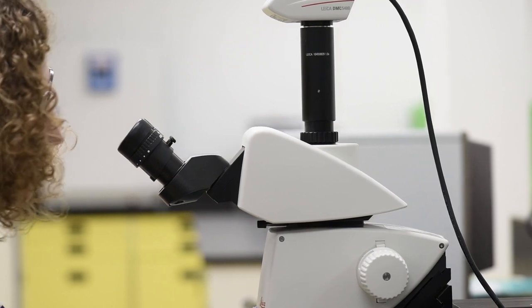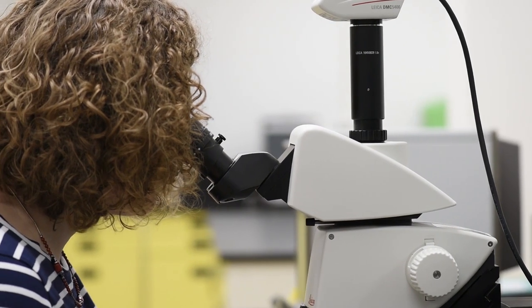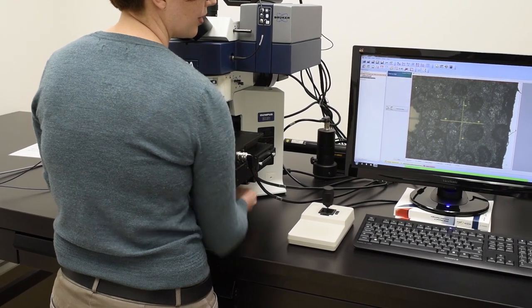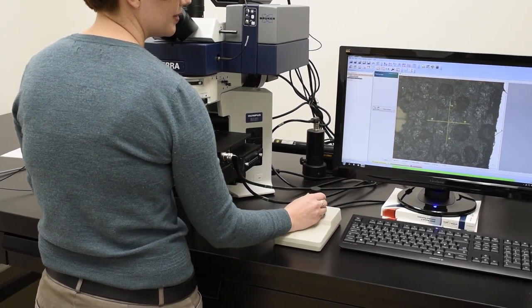Our analysis most often begins by examining the sample under a microscope. Samples then move through different testing streams that are dependent on their material composition.